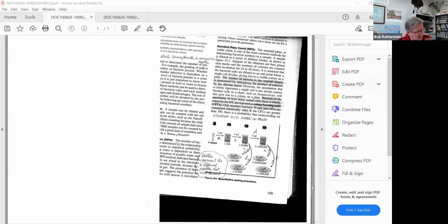I'm going to have you take a look on page 142, figure 19.3. You can read about the actual procedure of how we mix that. Check it out. It's described there in step number 3, page 141. So they mixed the water and the E. coli in bottle A using the prescribed procedure.